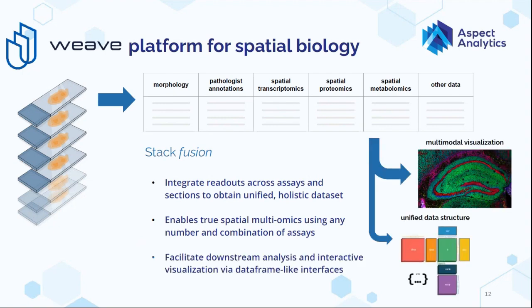Of course, this kind of data structure is not the end of an analysis, it's the very beginning. You can now, from a bioinformatics perspective, start from this integrated data structure and do whatever analysis you might want downstream. I have more examples of this coming up.